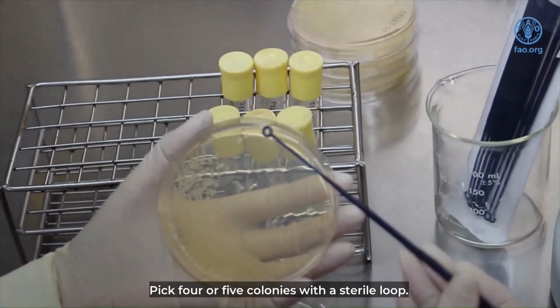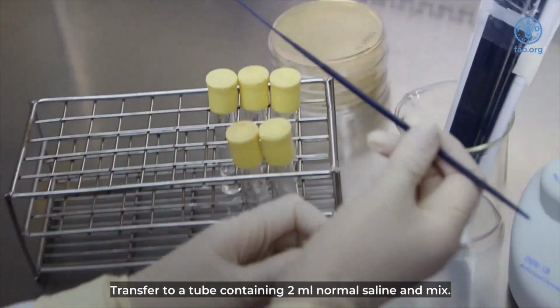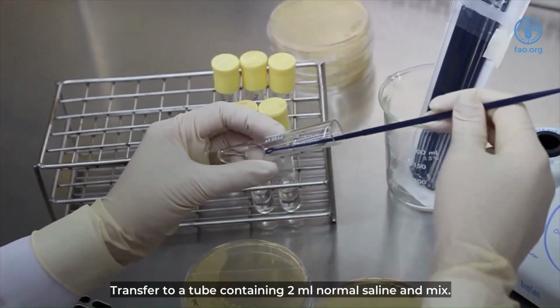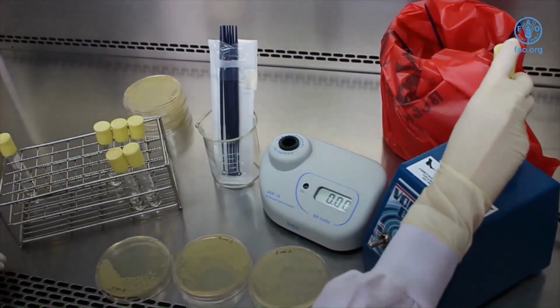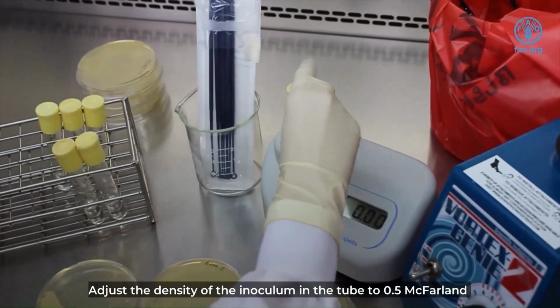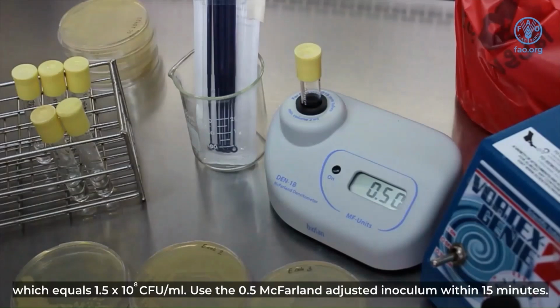Pick 4 or 5 colonies with a sterile loop. Transfer to a tube containing 2 ml normal saline and mix. Adjust the density of the inoculum in the tube to 0.5 McFarland, which equals 1.5 times 10 to the 8 CFU per milliliter. Use the 0.5 McFarland adjusted inoculum within 15 minutes.